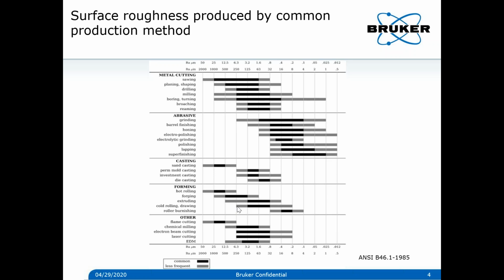Okay. The next question is asking about the roughness parameters. I think he needs more clarification of Ra, Rq, and RMS. Can you just elaborate a little bit more about Ra, Rq, and RMS? So the Ra is average roughness. This also depends upon multiple parameters, which norms you decide. I will send you the detailed description of how you determine the numbers over here.